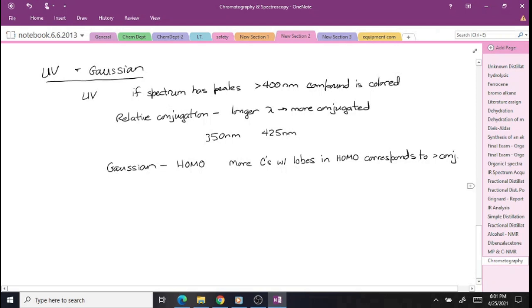When you make a comparison, is this one more conjugated than that? There are a lot of compounds that might fit that. So using this as a confirmatory test isn't very good, but we can use it as an exclusionary one. For example, let's say the UV visible spectrum said that the tetraphenyl cyclopentadienone had greater conjugation than the product. Remember, we made a product that we believed was TPN, but we want to confirm that.